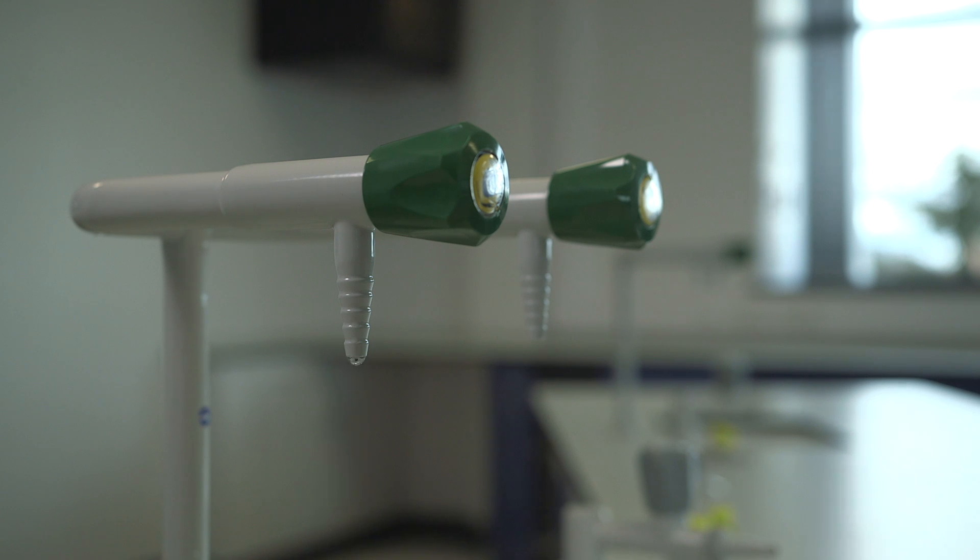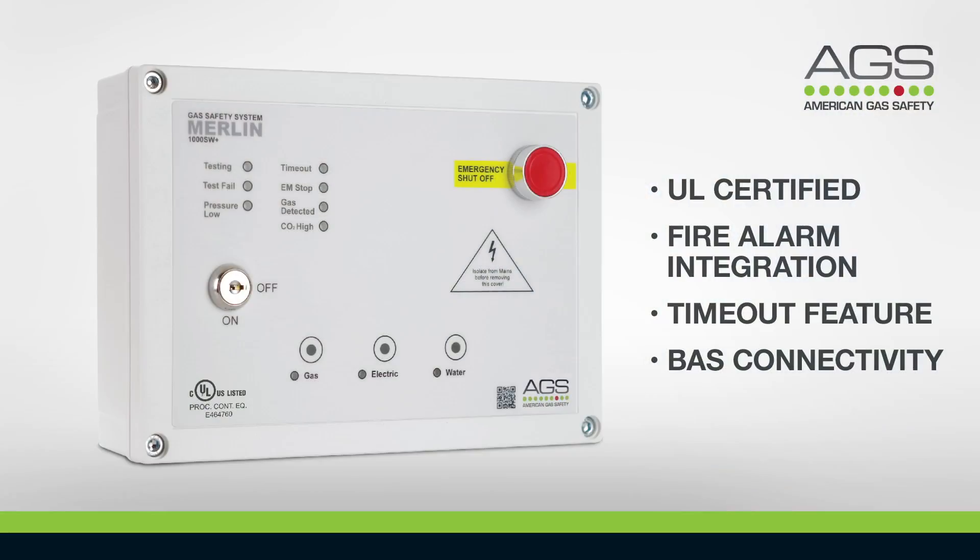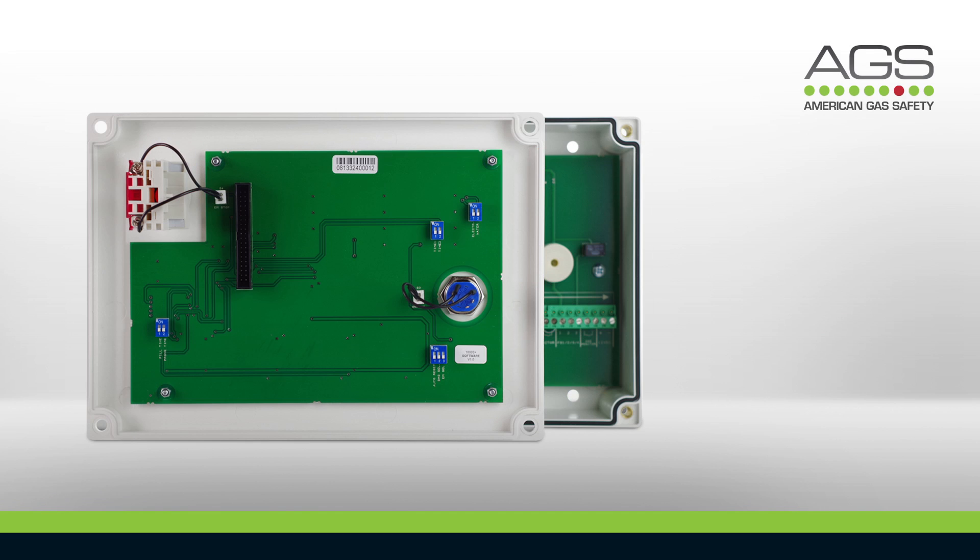This function protects the room during class time and after hours as well. Adaptable functions include the built-in timeout function, which can be changed via a simple dip switch found on the reverse of the fascia panel. Electrics and water can also be chosen to stay on in alarm mode via the dip switches. And the BAS output can be changed from signaling an alarm situation to gas on, gas off.